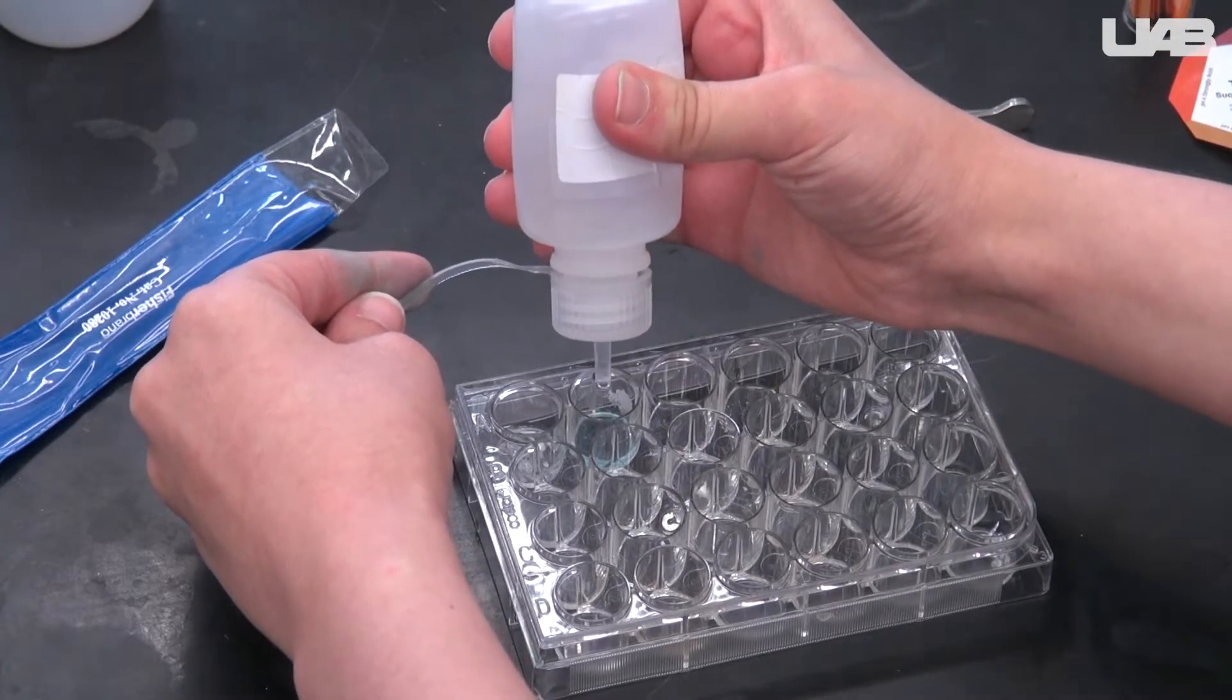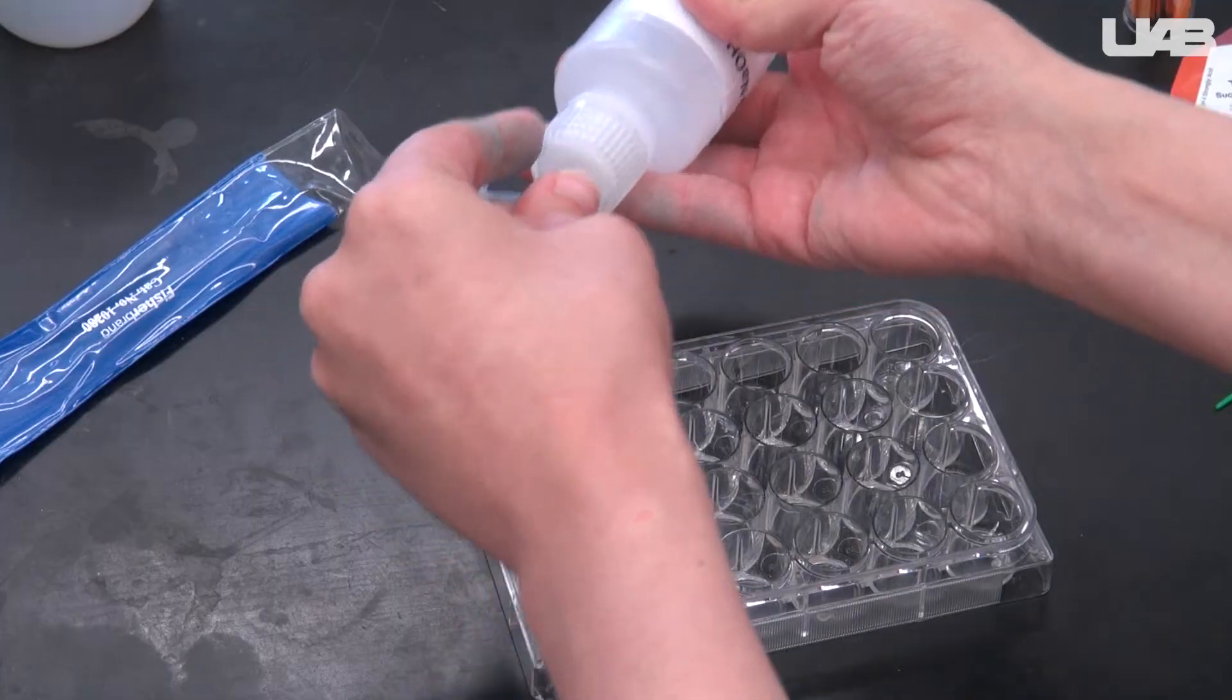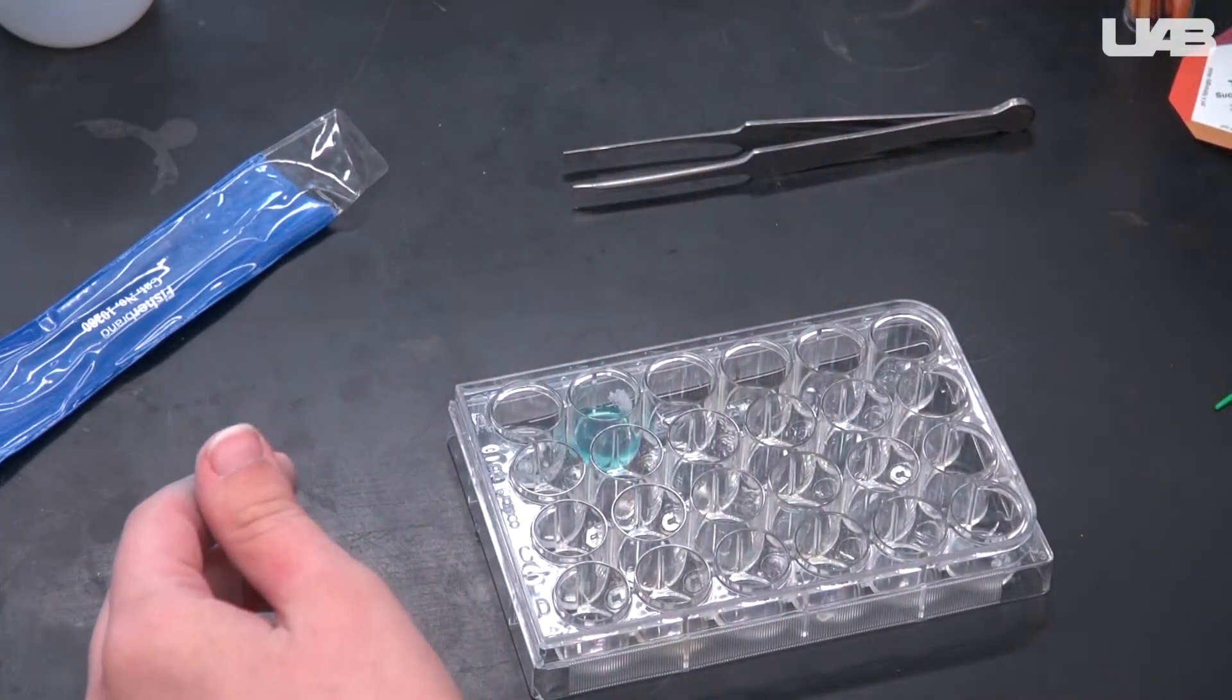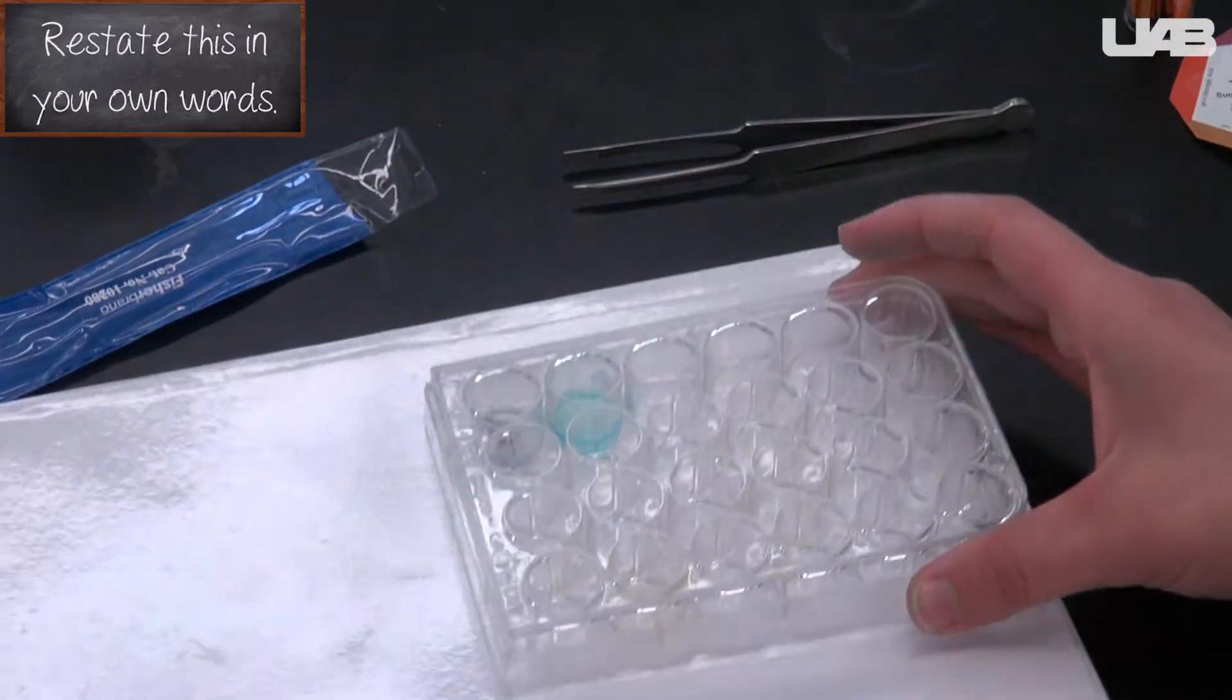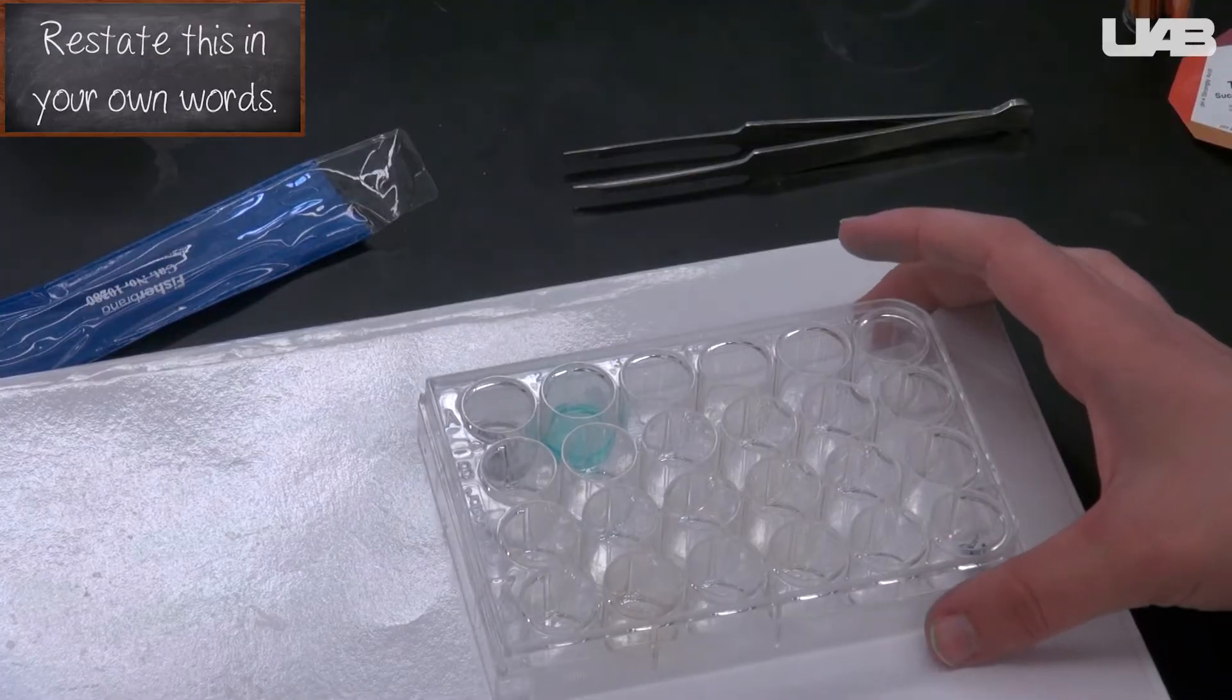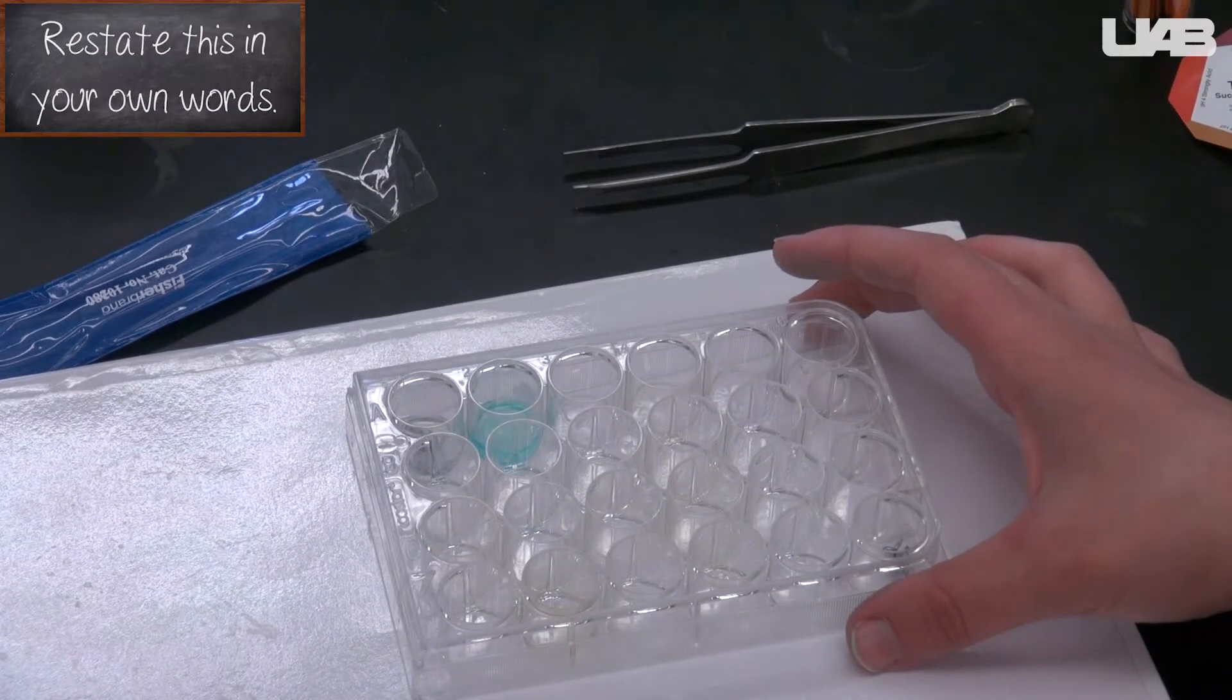Sometimes the bubbles or precipitate particles are small and hard to see, especially against the black background of your lab bench. If you move the well plate to a blank white page of your notebook, you may have an easier time seeing your results.